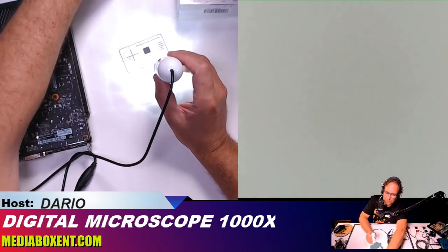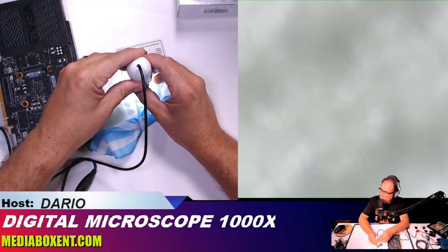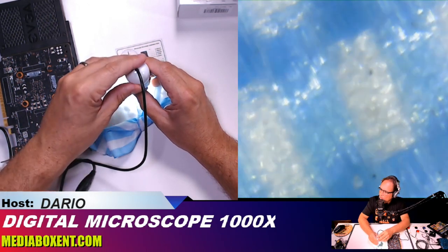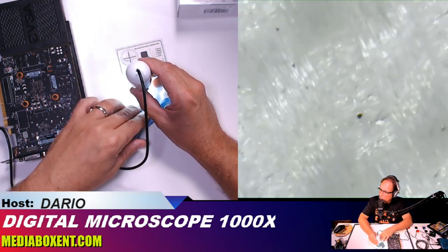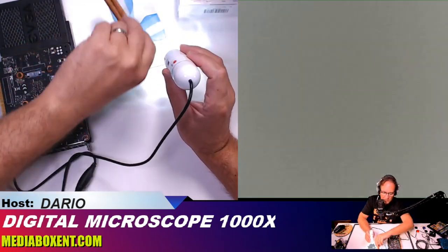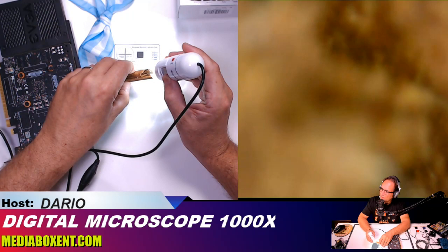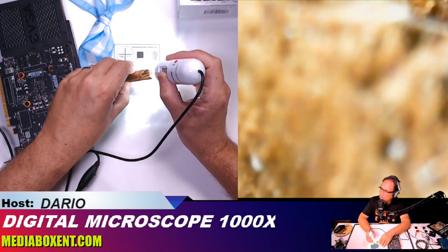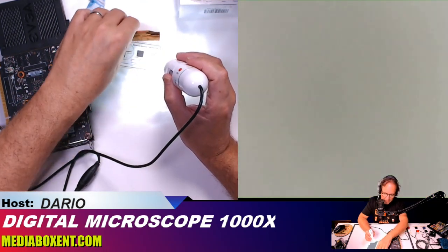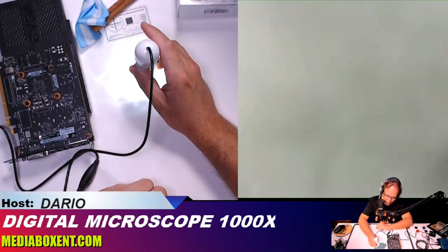Now let's look at a piece of fiber. So this is a piece of fiber. You can use this to inspect fiber, or even a collector's coin. You can see there's some hair in the fiber too. It's good for inspecting anything — let's take a quarter and inspect the coin.